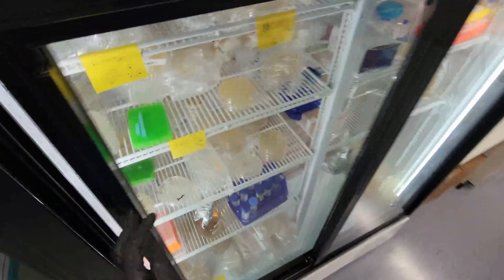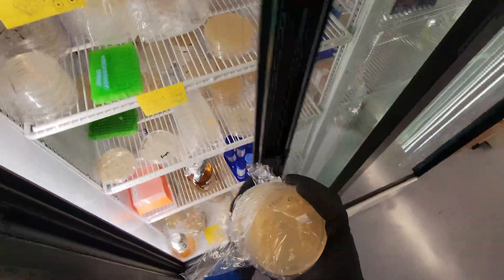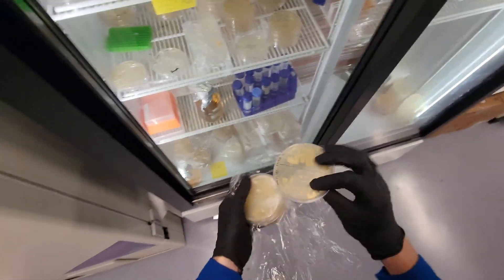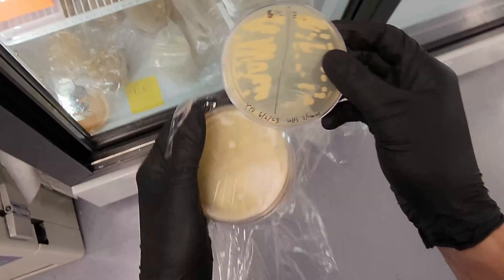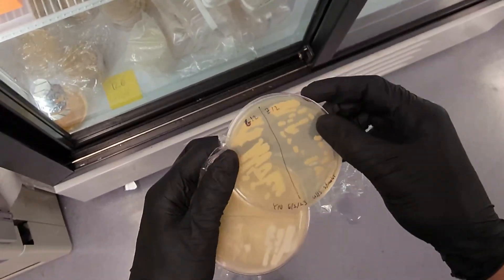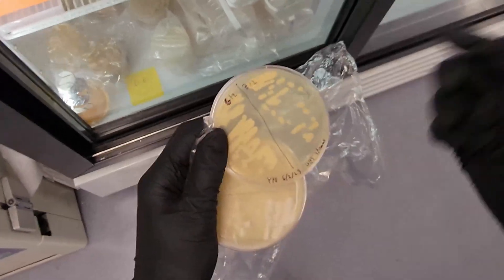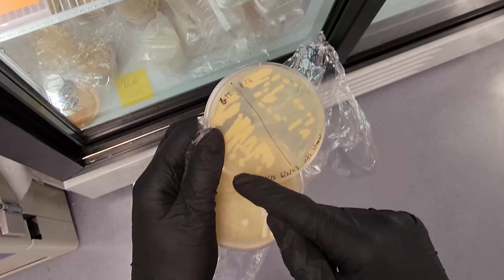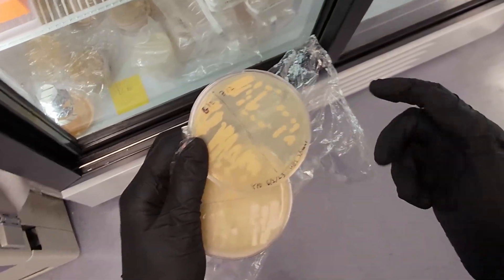One last thing — let me prove to you that I'm not crazy and that we'll get single colonies. So these are some streak plates that I made. These are actually the exact same strains, but they've been in the fridge for a long time, and that's why I'm making new ones. There's G12 and Z12. I've used some of the colonies and they've grown a bunch, so that's why I'm making new ones. I did the exact same streaking method — you see, I was getting individual colonies.